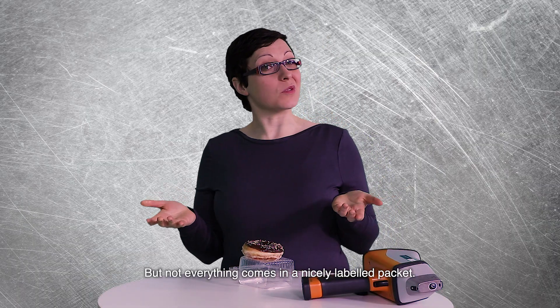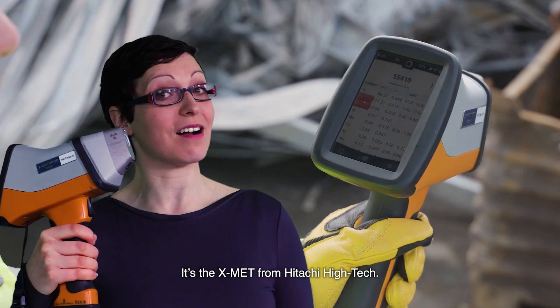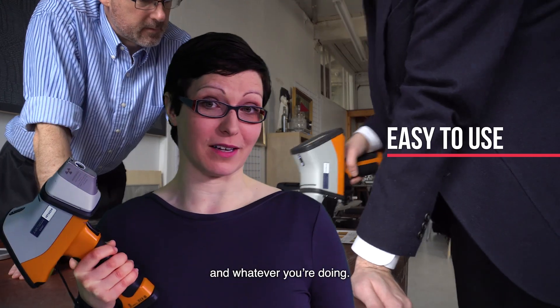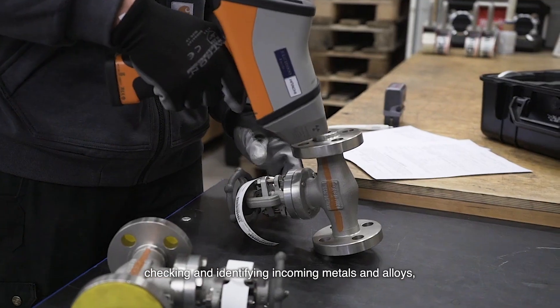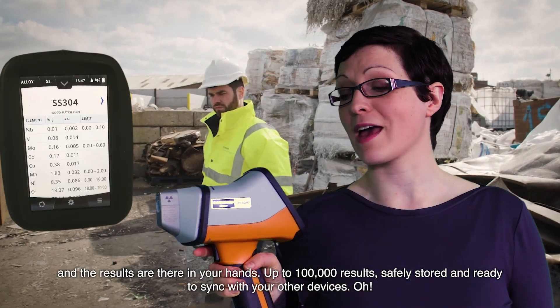But not everything comes in a nicely labeled package. That's where this baby comes in. It's the X-Met from Hitachi Hi-Tech. It's super easy to use wherever you are and whatever you're doing — sorting scrap metal, screening soil samples, checking and identifying incoming metals and alloys. And the results are there in your hands.